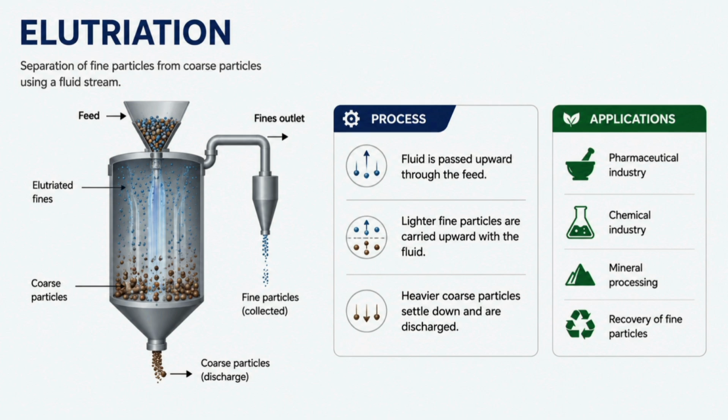The upper liquid is poured off and the fine particles are allowed to settle down on the bottom. The wet paste containing the fine particles is then dried. Later we have to collect the settled content and then dry it. In small scale grinding a conical flask can be used, but on large scales elutriation tanks are used. So that's all about the levigation and elutriation methods.